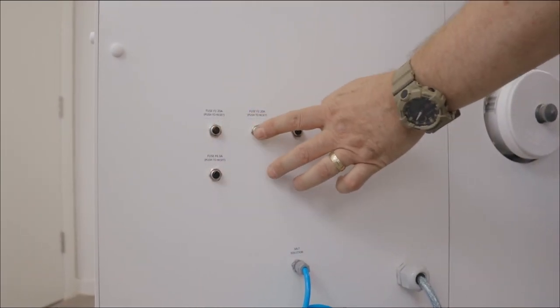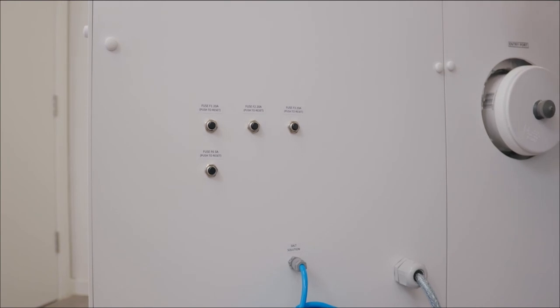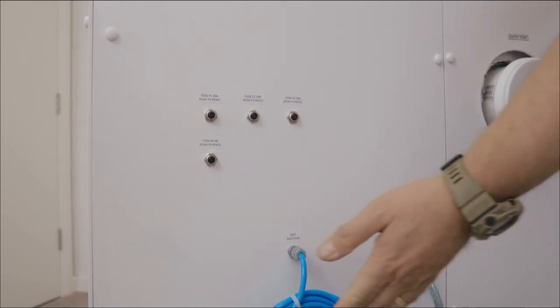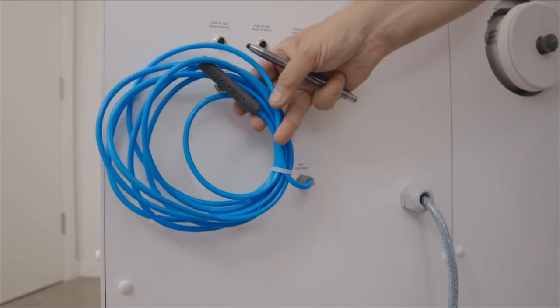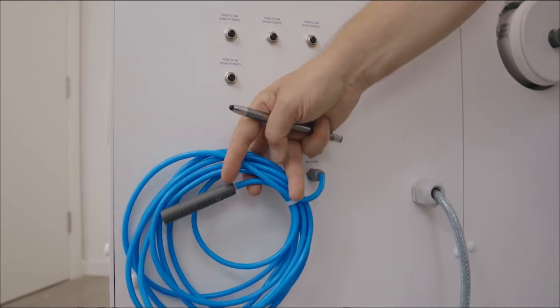We have a series of push button to reset circuit breakers. We have the blue salt solution supply line which would be fed into the salt solution reservoir.